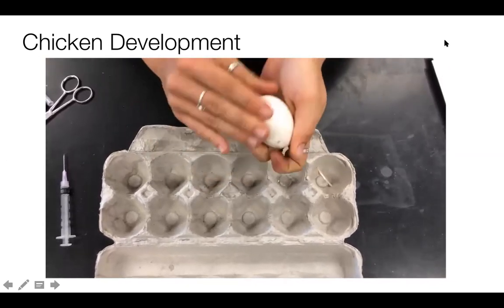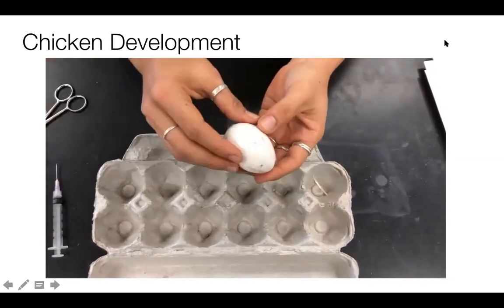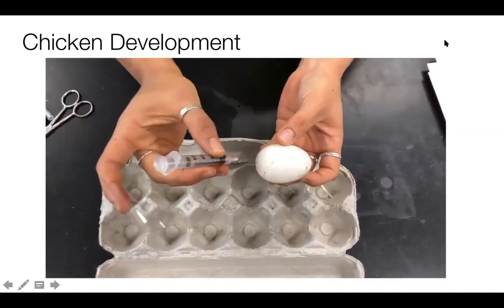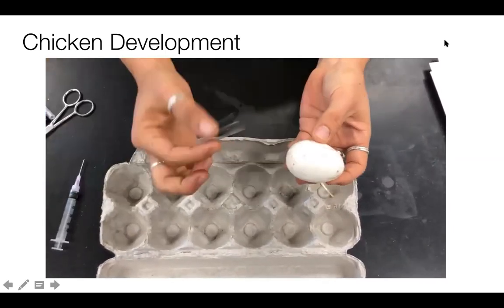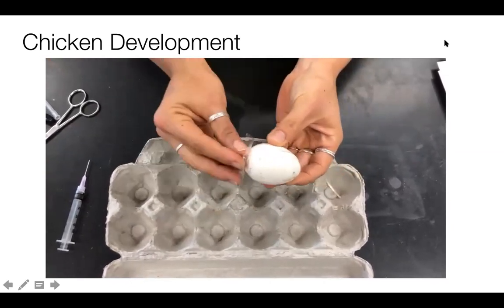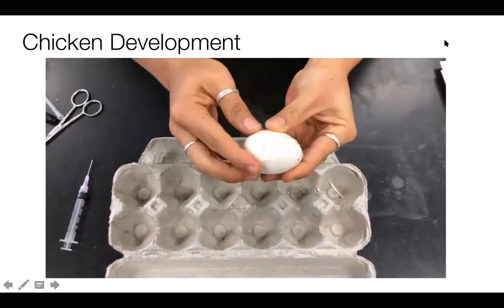Before we cut the window, we have to remove some of the liquid so it doesn't all come out while we're cutting a window. So you're going to take a needle and aspirate about 1 milliliter or 1 cc out of the egg, and I'll show you how to do that here. But first we're going to place another piece of tape over the blunt edge of the egg. Again, that's just going to help with any cracking that may happen.